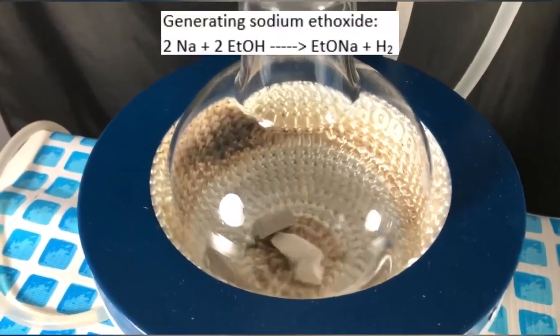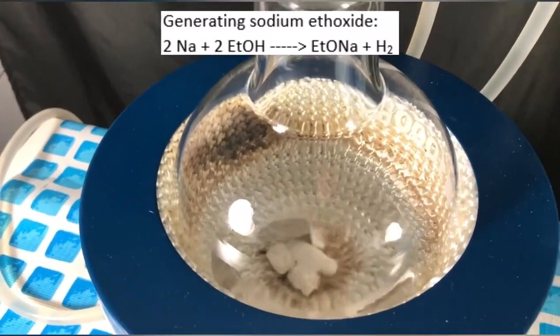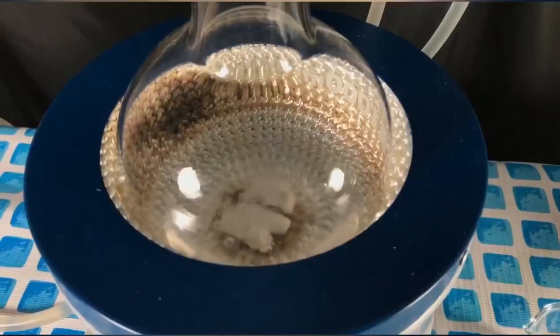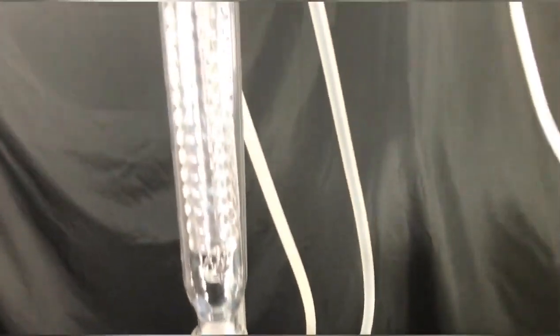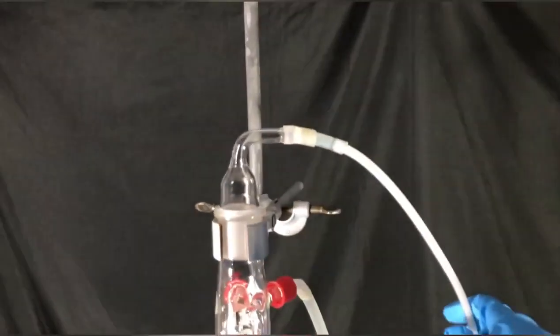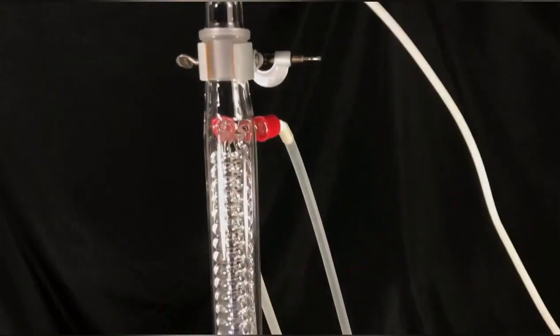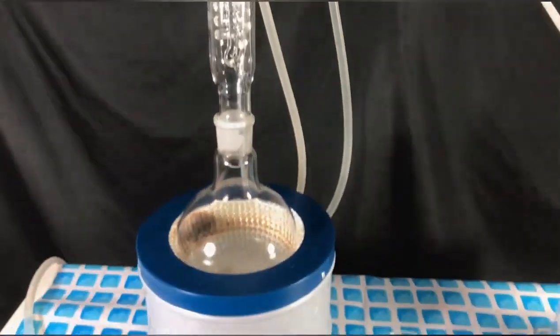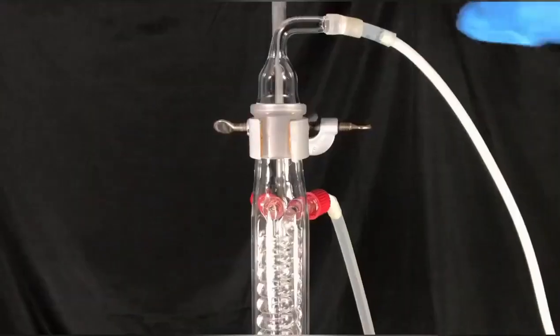The sodium will react with the ethanol, forming sodium ethoxide and releasing a lot of heat and hydrogen gas. To keep down the ethanol that will inevitably start boiling, a reflux condenser was connected to the round bottom flask. The flammable hydrogen gas was led to the outside world through this hose. It took approximately 10 minutes for all of the sodium to dissolve.